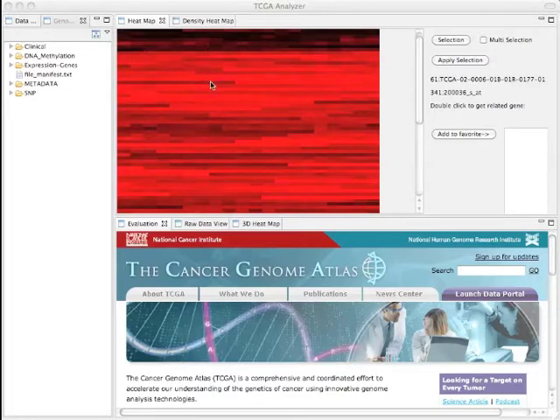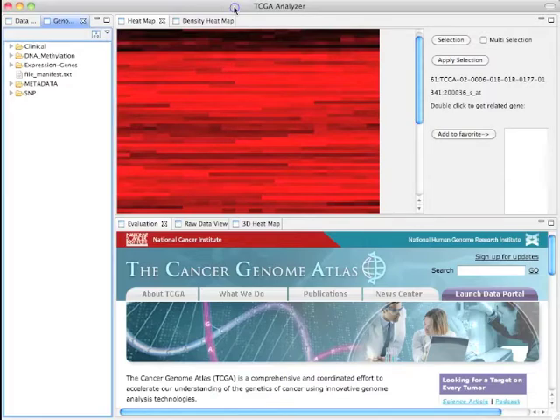Using this, a researcher would typically use the heat map to navigate the genome data. Points or areas of interest could be located on the heat map by looking at a gene that had, say, different values for different sample values. Or perhaps a point of interest might be a gene that expressed high values throughout all the sample values.